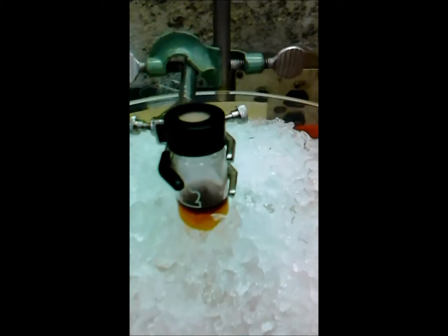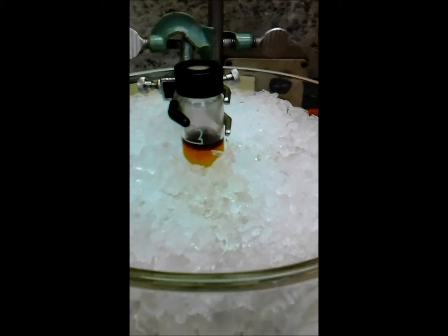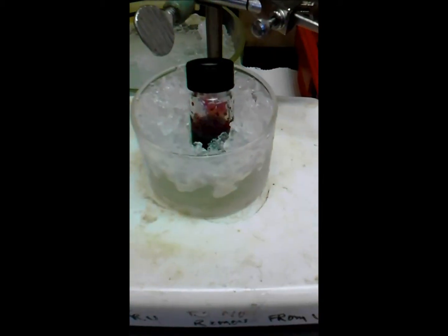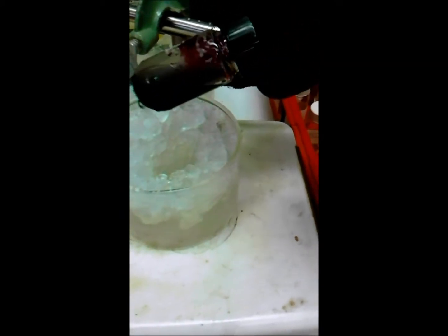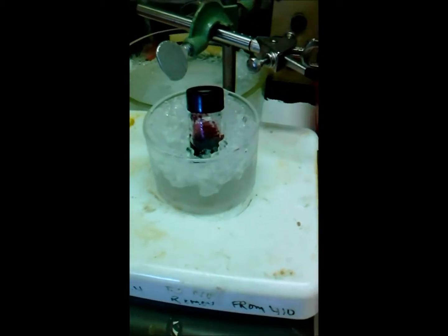So upon the addition of the fourth 200 microliters of heptanoyl chloride, perhaps it was added a little too fast. We have these two different layers coming up. I don't know if it's because there's water in the solution or what. Alright, so after addition of all the heptanoyl chloride, the solution is now a dark purple. There's actually some solid chunks in there. It's going to stir for a little while longer on ice, and then we're going to let it stir at room temperature.